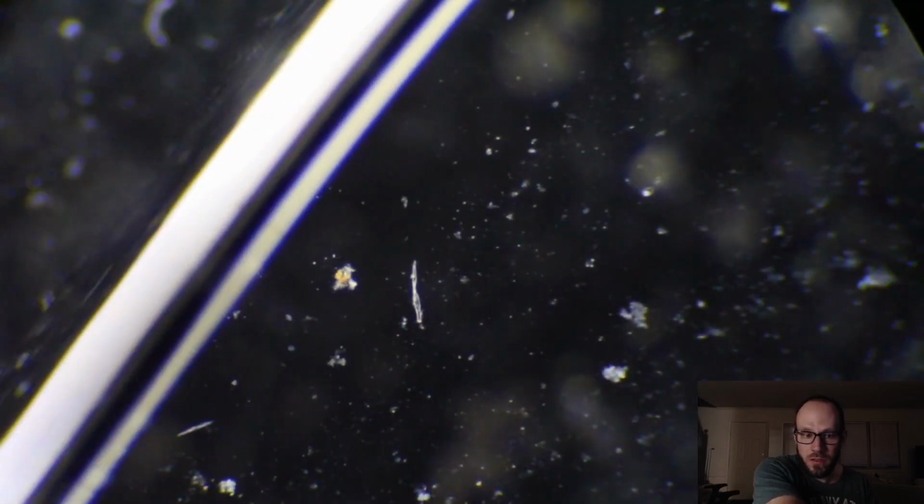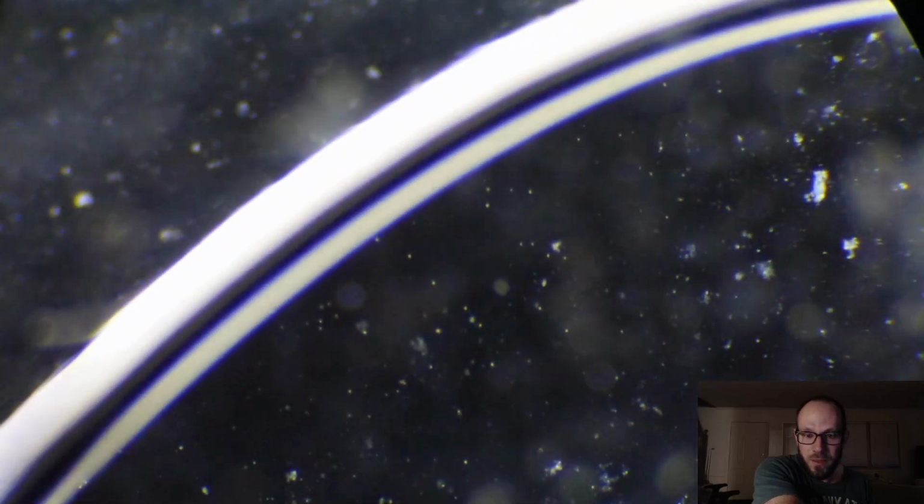Yeah, look at all these guys swimming around. You can see the water's edge. Beyond it, there isn't going to be anything alive. In fact, if I focus on whatever I see, it's just garbage. All of this requires water to live. That's why I keep it in my little humidity chamber, which is just a plastic Tupperware with a moist paper towel. Humidity chamber.